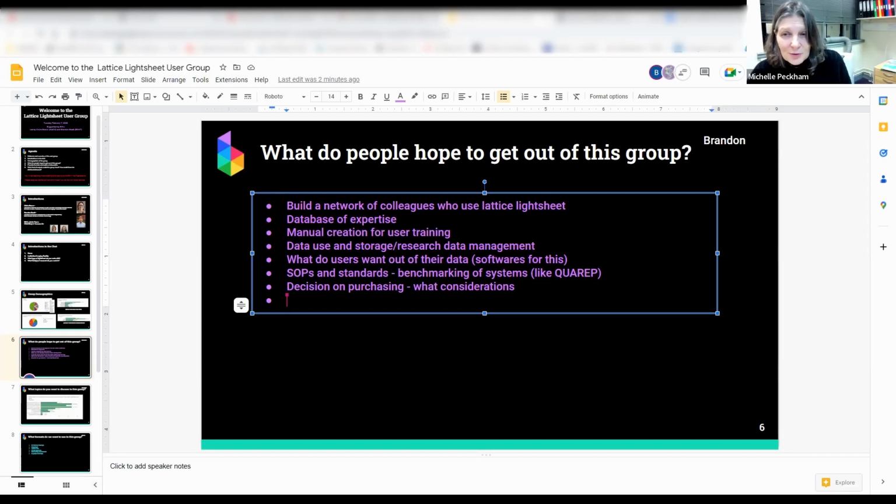We've had all sorts of things. We've even had lipid vesicles where you mix 2 lipid vesicles together and they kind of collapse and do all this amazing stuff, imaged in 3D very fast, very good. You know, so there's all sorts of things you can do with a light sheet that maybe you never knew until you asked.